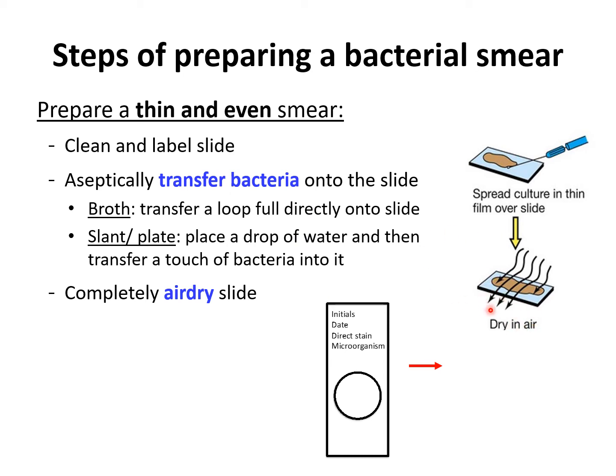Make sure that you completely air dry it, and you gotta be patient. Don't blow on your slide, don't fan it, because that can aerosolize the bacteria in the air, which is not good. The reason you want to completely air dry it is that we're going to do further steps where we have to rinse our slides several times. If your slide is not completely air dried, the bacteria on your slide can get washed off and you've lost your sample.